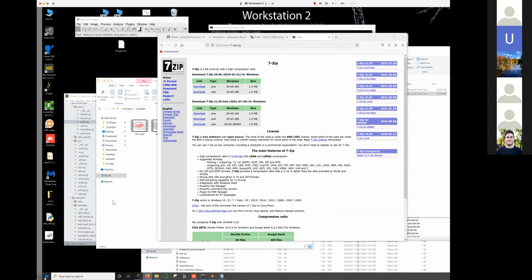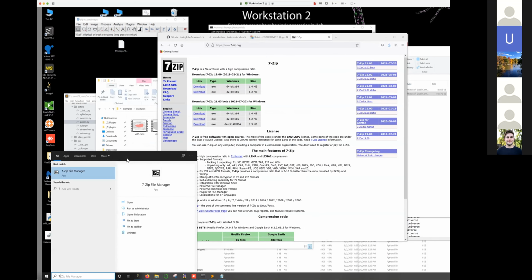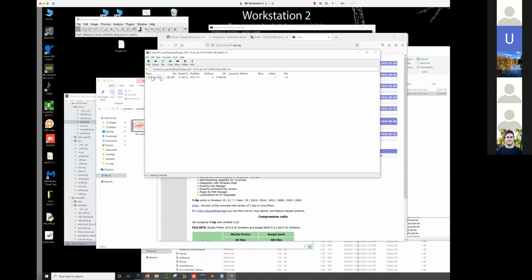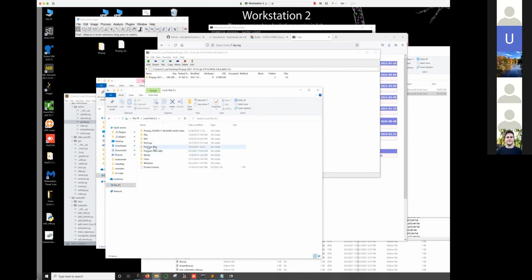It depends how your 7-zip is working on your computer, but if you're having some trouble unzipping it, just run 7-zip. This folder inside the zip file, you can just extract out, and we can rename it to a simple folder name. We can just call it ffmpeg. And this folder, we can just copy to our Program Files. So I'm going to drag and drop this in here.